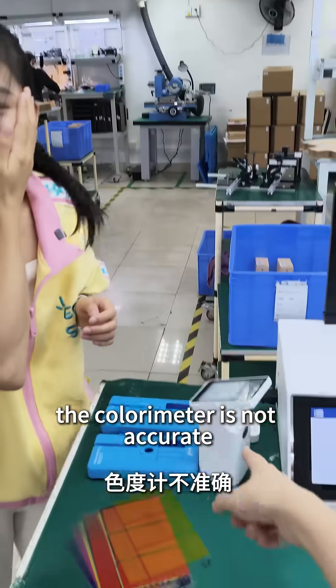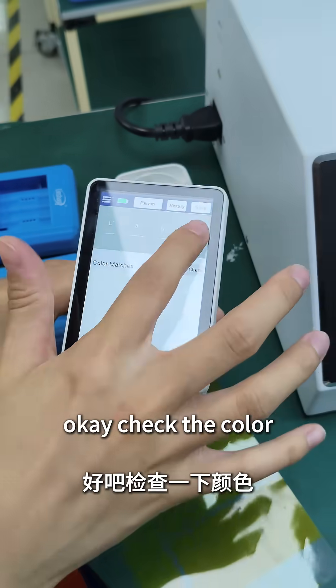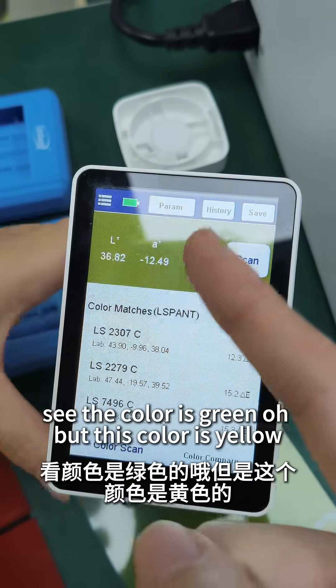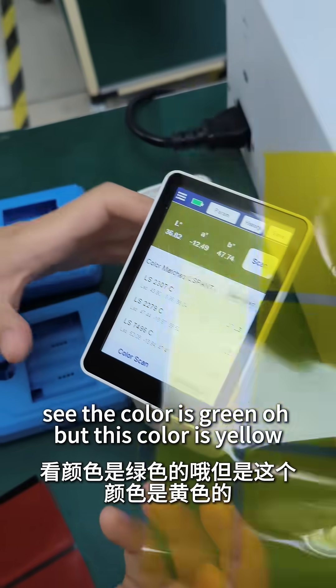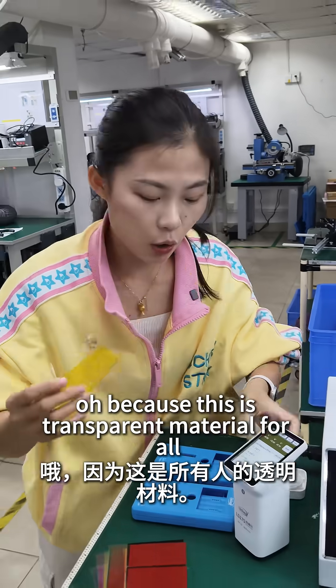What's wrong with you? The colorimeter is not accurate. Why? You can test it. Check the color. See, the color is green, but this color is yellow. Oh, because this is transparent material.